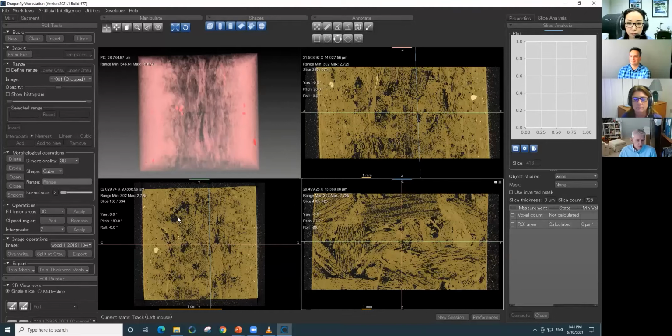But in cases where you're using the CT system to image a simple system, like a plastic part with an air background or a metallic part with an air background, where you have simple high contrast phases, then you don't have to resort to machine learning, and you can just go with a simple automatic thresholding. But in any case of material samples where you have subtle textures, I go directly to these AI methods.